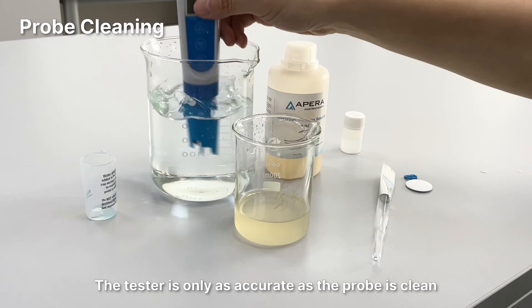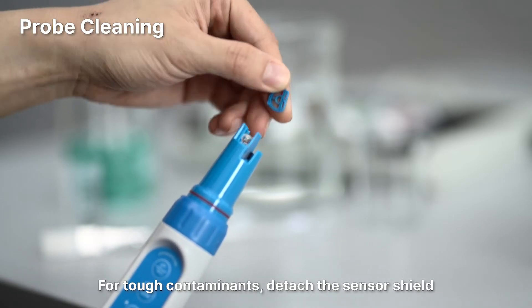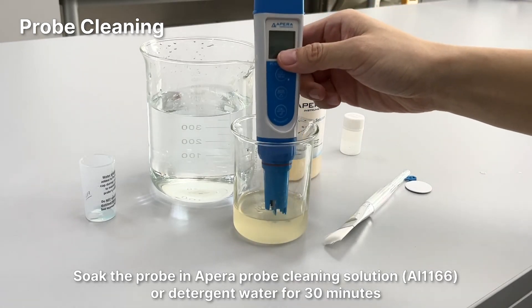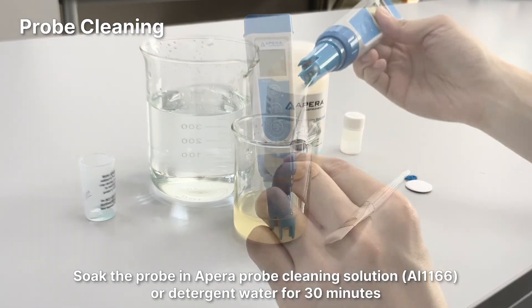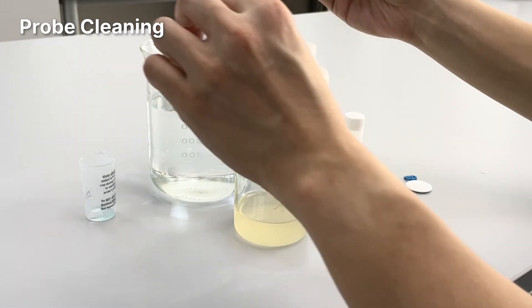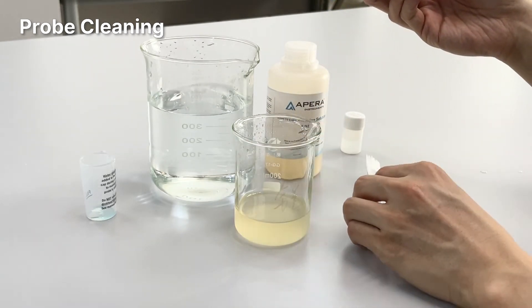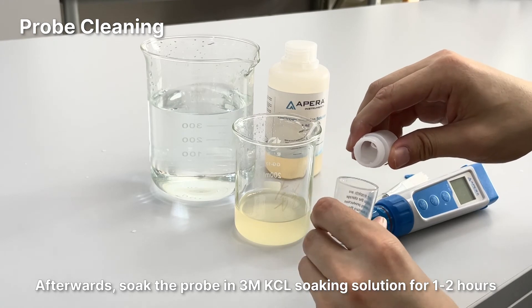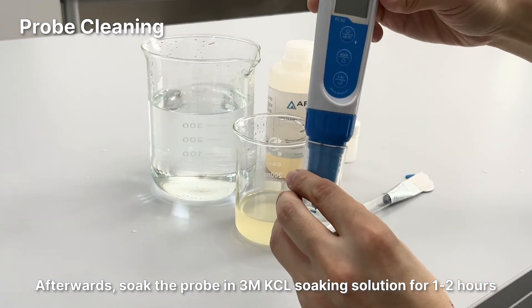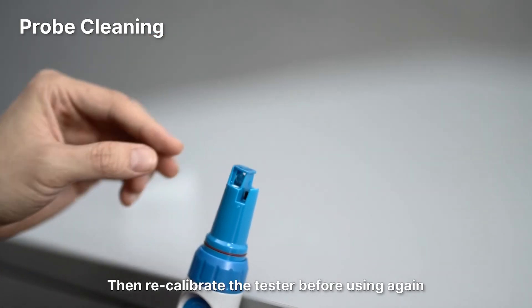Probe cleaning: The tester is only as accurate as the probe is clean. Always thoroughly rinse off the probe before and after each measurement with pure water. For tough contaminants, detach the sensor shield and soak the probe in a Para probe cleaning solution or detergent water for 30 minutes. Then use a soft brush to clean off the contaminants on the sensor. Afterwards, soak the probe in 3M KCL soaking solution for 1-2 hours, rinse it off, put back the sensor shield, and recalibrate the tester before using again.